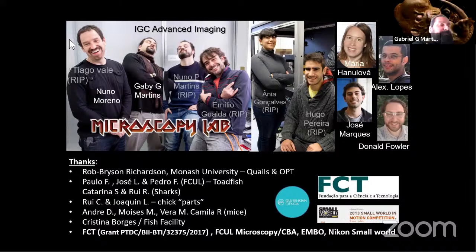You're interested in large-scale imaging. The other thing is that you actually do see effects. For example, if you look carefully at the movies that I was playing on that mouse, you may notice that the brain seems to be shrunken. Some tissues shrink more than others, okay? And that used to worry me a lot until techniques like expansion microscopy started coming along and people demonstrating that it's actually possible to blow things up 4 and 10 times and the three-dimensional relationship between things is still kept there.